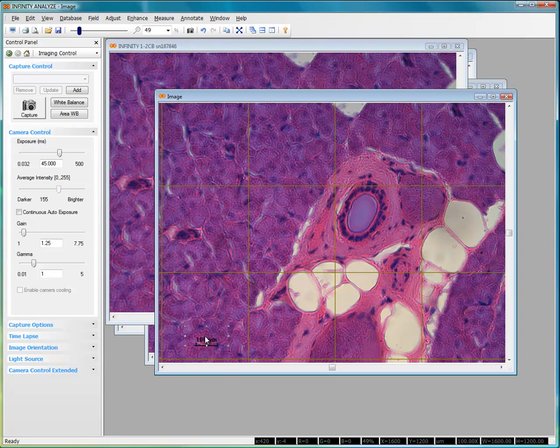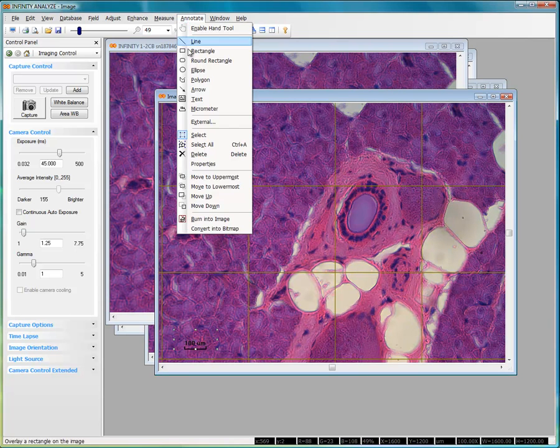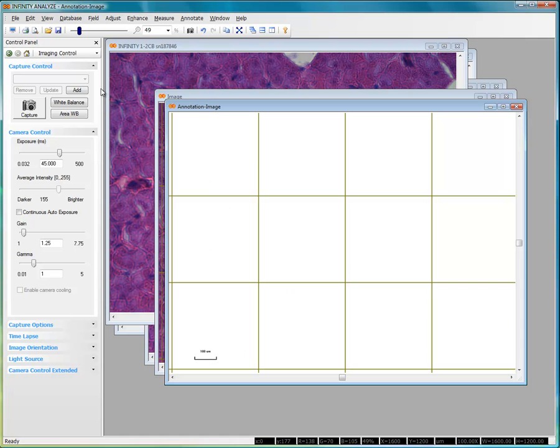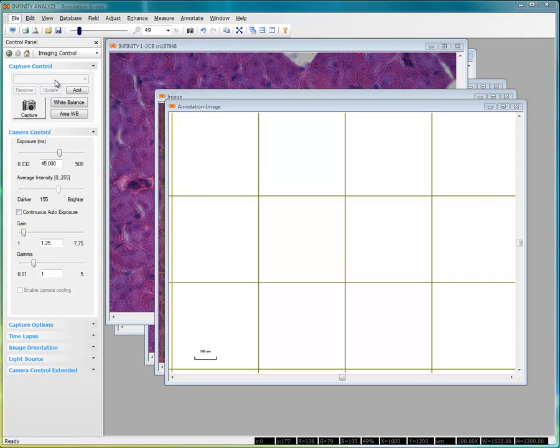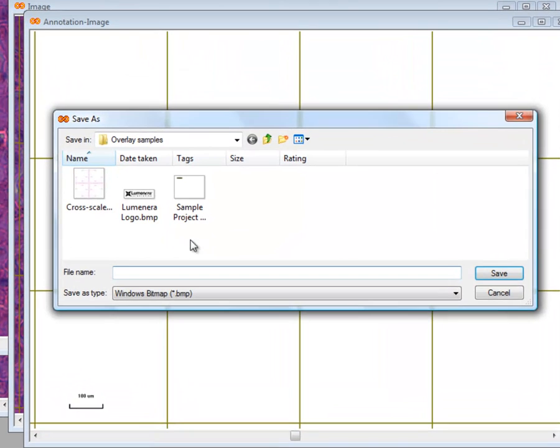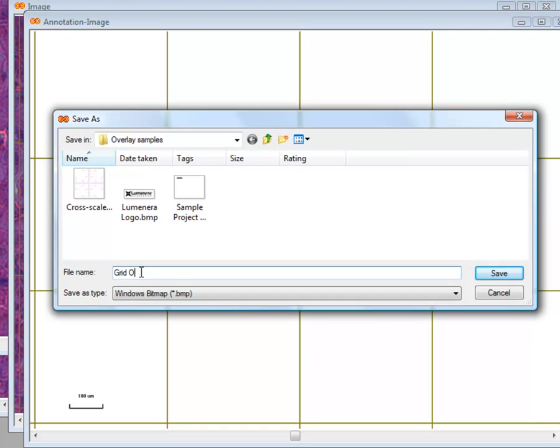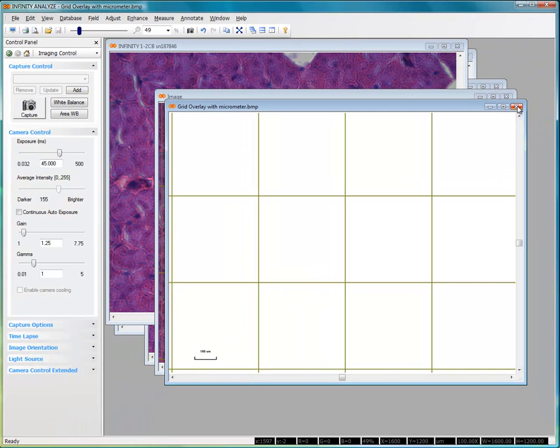Now I've got an annotation that can also appear in my images, and I go to Annotate and select Convert into Bitmap, and now I have a grid and my micron text that would appear. And the same technique of File, Save As, and now I can specify Grid Overlay with Micrometer. Save that as a bitmap, and close that.